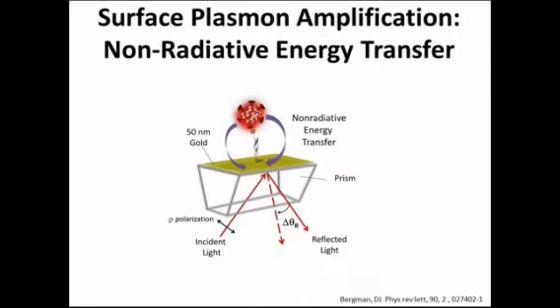We believe the signal amplification is attributed partially to a mass loading effect, but in addition to the surface plasmons generated from the gold surface exciting the quantum dots, which then transfer their excitation energy by radiationless transition to the gold resonance nanosystem. A few important conclusions we were able to make from our early work are that the surface chemistry influences SPRi detection sensitivity and amplification, and that the 800 nanometer quantum dots experience more signal amplification as a result of more coupling occurring with the propagating surface plasmon resonance.